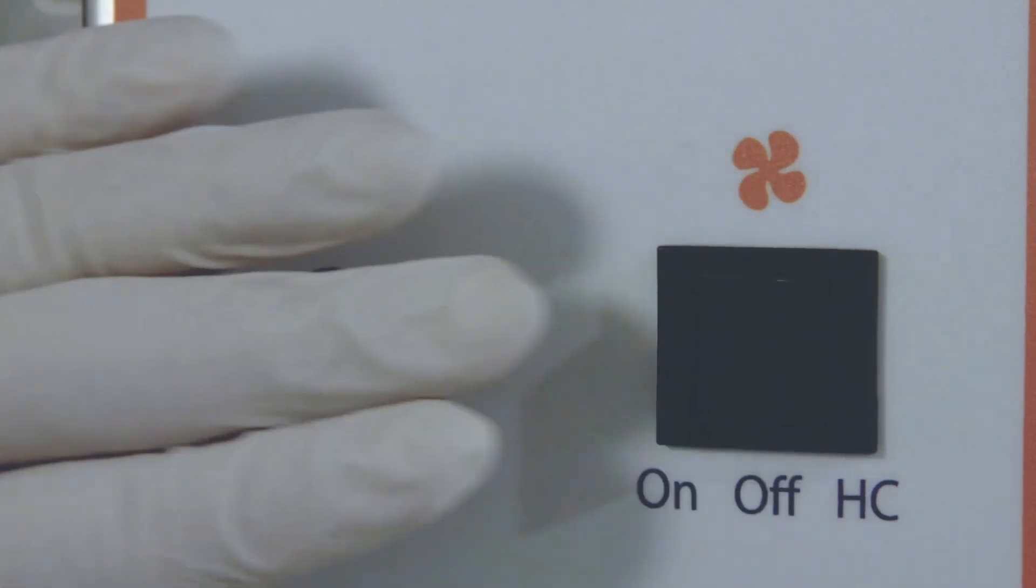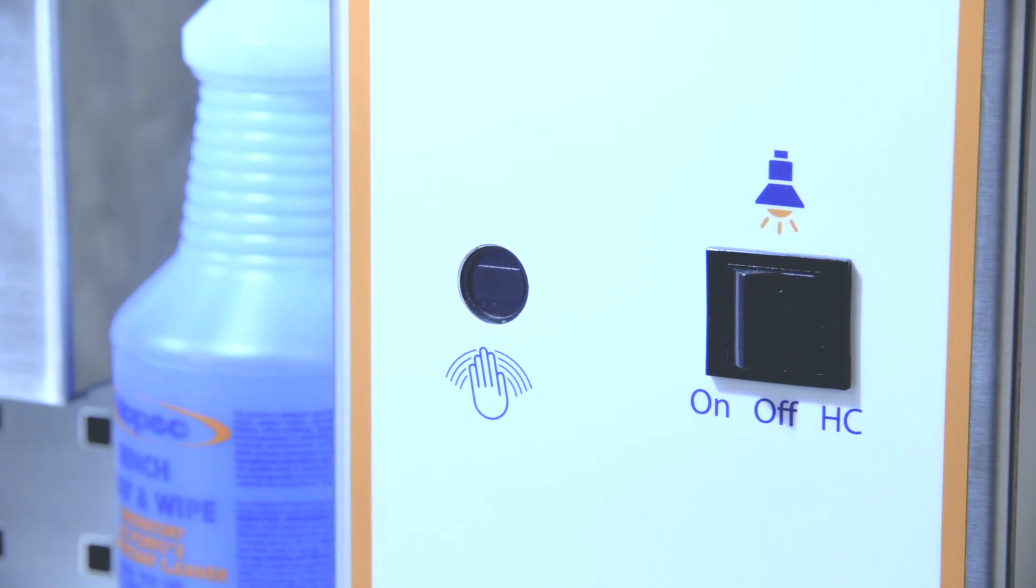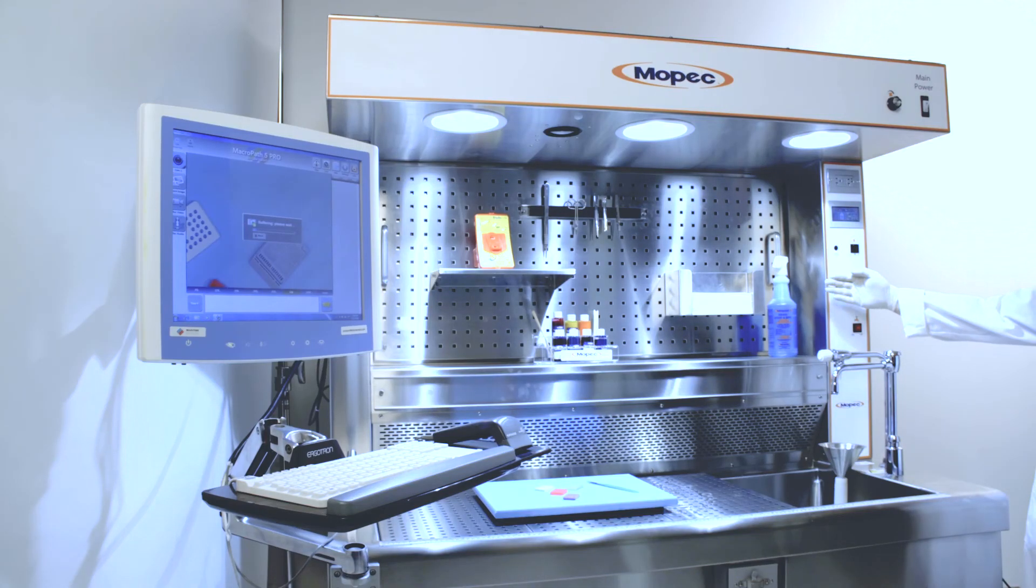The unit is also equipped with a proximity sensor that powers down to save energy and add longevity to fans, motors, and LED lights when the station is not in use.